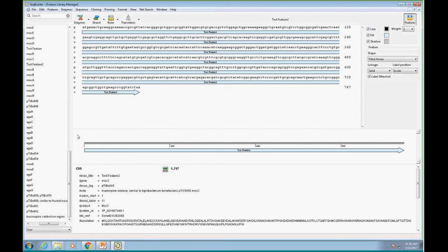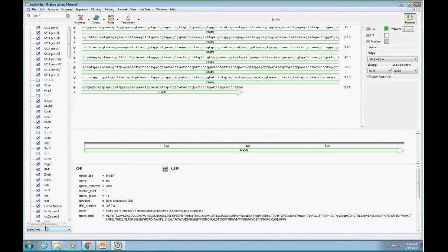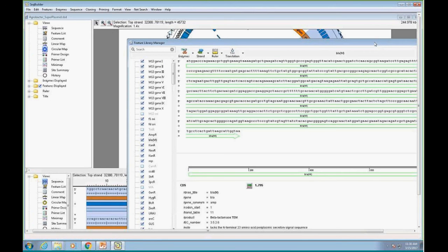I can create a subset of my own custom features, and I also have the DNASTAR highly curated features for plasmid annotation. And with that, that's all I have today. It's a workflow that is going to be very useful, a great time saver for those who are looking to annotate sequences, in particular plasmid sequences. With that, I'll take any questions. Thank you.